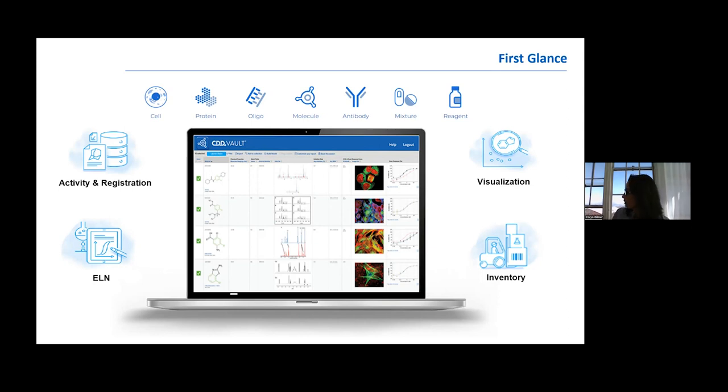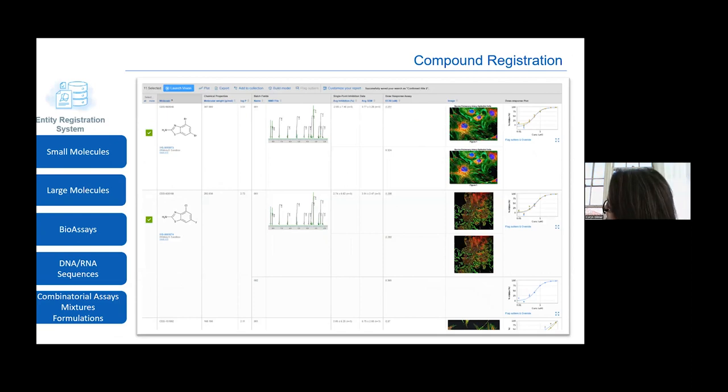The first one is entity registration system. Compound registration allows you to store your data related to small molecules, large molecules, bioassays, DNA and RNA sequences, combinatorial assays, mixtures, and formulations.